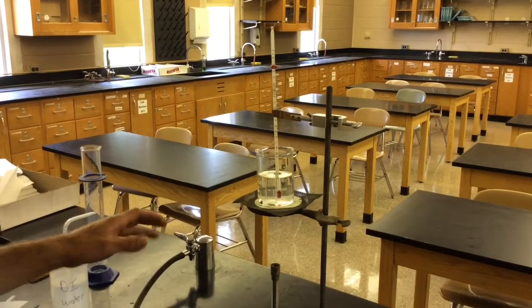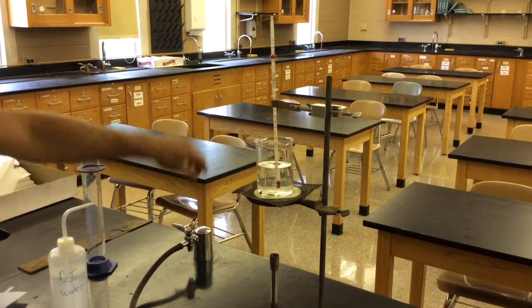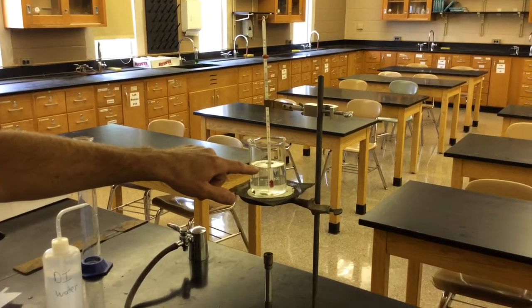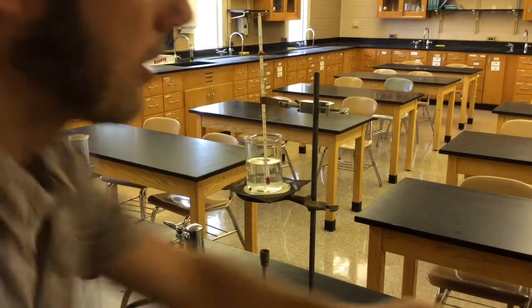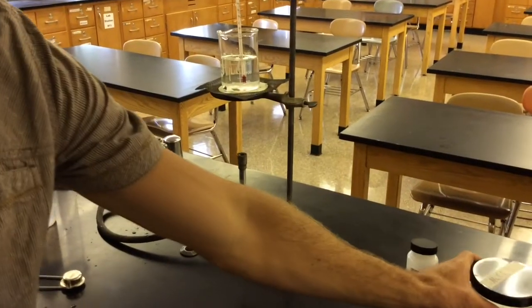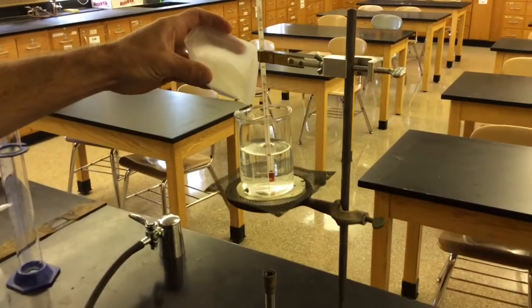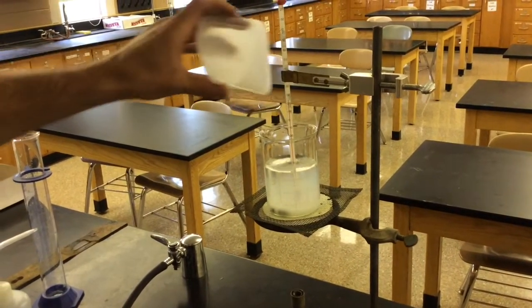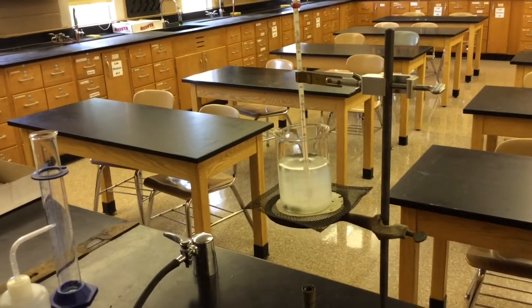Once you get that done for 5 minutes, turn off the gas at the gas jet, and the level of this water has probably come down a little bit because the water evaporated, so we could fix that. But what you want to do now for the next run, we are going to add in table salt. So you have a certain amount measured, whether it's 10 grams or 20 grams, and you just dump it in. And you don't even have to worry about stirring it at this point, because when it's heating, it will cause enough motion for that stuff to get mixed up.